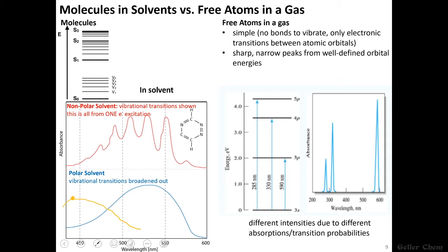All it can do is measure the total absorption of light at any given wavelength. So it would actually interpret, say, this wavelength as being absorbed as the total sum of the absorption from both of those chemicals. And so these two peaks might combine to create some larger peak that looks like this, which is pretty much impossible to analyze.